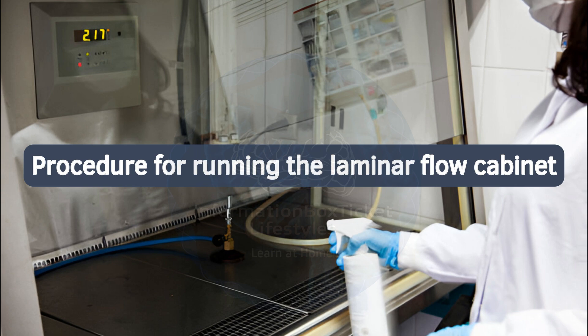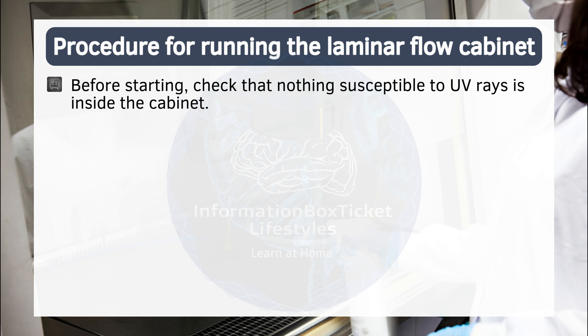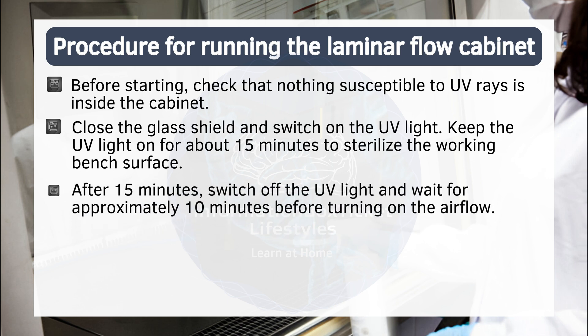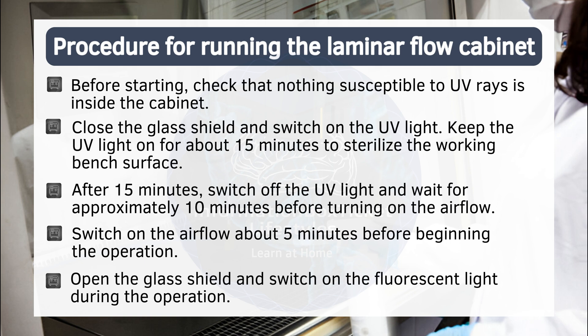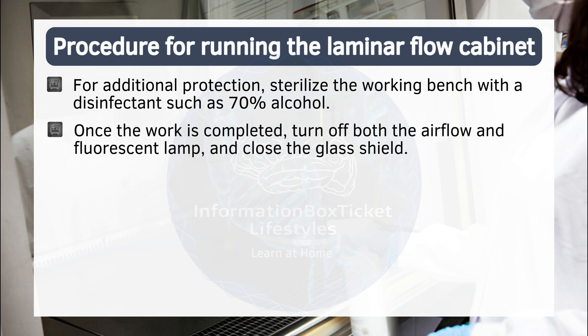Procedure for running the laminar flow cabinet. Follow these steps to operate a laminar flow cabinet. Before starting, check that nothing susceptible to UV rays is inside the cabinet. Close the glass shield and switch on the UV light; keep it on for about 15 minutes to sterilize the working bench surface. After 15 minutes, switch off the UV light and wait approximately 10 minutes before turning on the airflow. Switch on the airflow about 5 minutes before beginning the operation. Open the glass shield and switch on the fluorescent light during the operation. For additional protection, sterilize the working bench with a disinfectant such as 70% alcohol. Once the work is completed, turn off both the airflow and fluorescent lamp and close the glass shield.